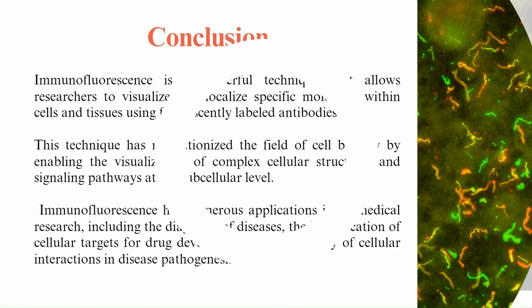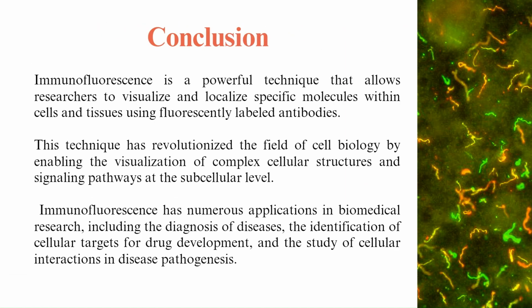To conclude, immunofluorescence is a powerful technique that allows researchers to visualize and localize specific molecules within cells and tissues using fluorescently labeled antibodies. This technique has revolutionized the field of cell biology by enabling the visualization of complex cellular structures and signaling pathways at the subcellular level. Immunofluorescence has numerous applications in biomedical research, including the diagnosis of diseases, the identification of cellular targets for drug development, and the study of cellular interactions in disease pathogenesis.